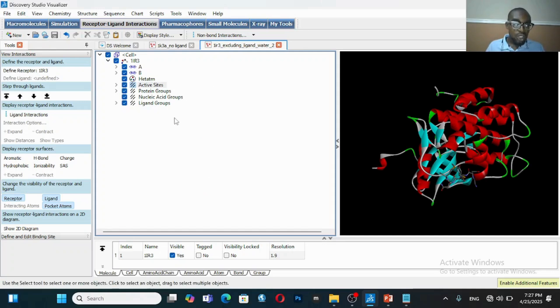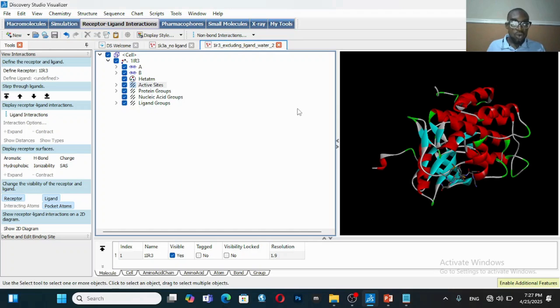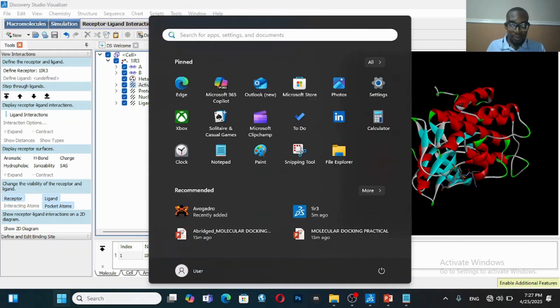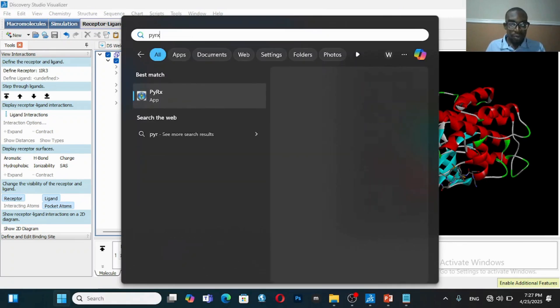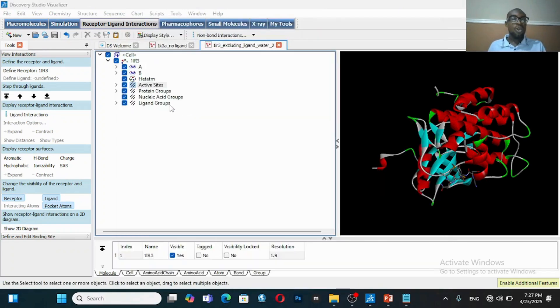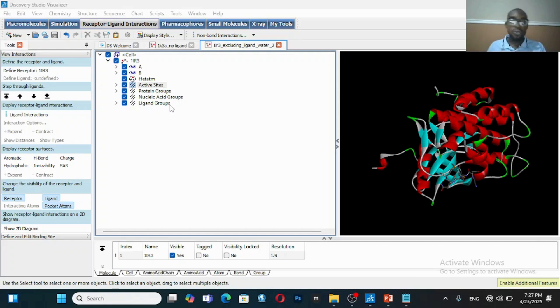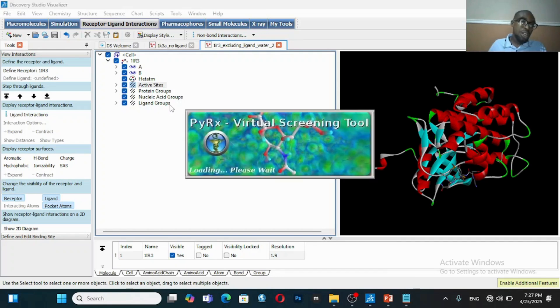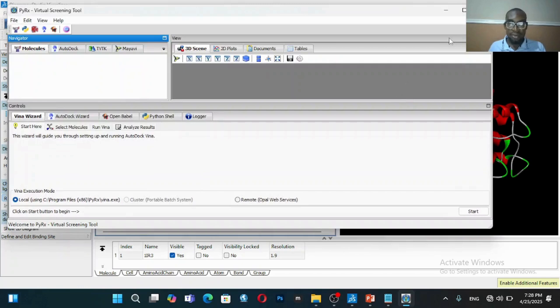Once you've done that, that means you have your target receptor, but remember you've removed the co-crystallized ligand and you've removed water. Now the next thing you do is to open PyRx. Before you must have done this, it's important that you had modeled your compound, so you must have used a software maybe ChemDraw, Chem3D to model your compound, or Avogadro.